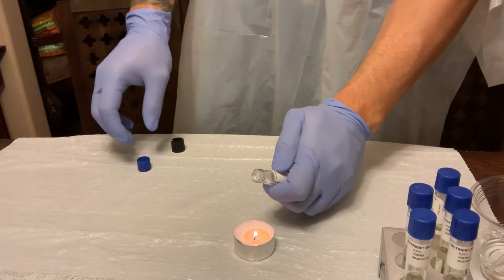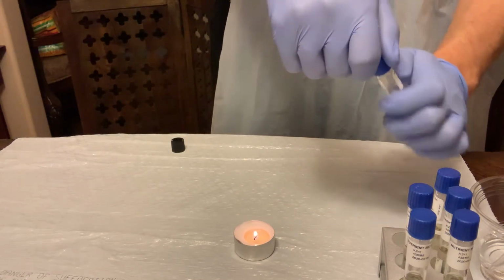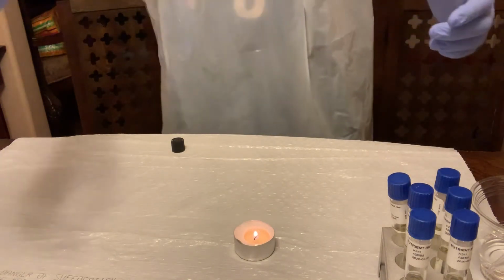And then let's inoculate this, and then we're going to cap it. Cool. And then we'll continue the process for the rest. But that should conclude our lab video exercise. Thanks guys, have a good one.